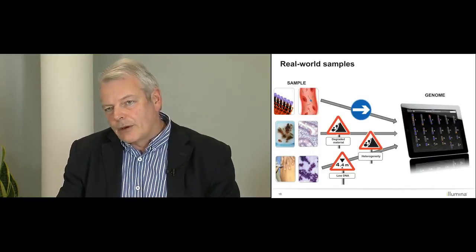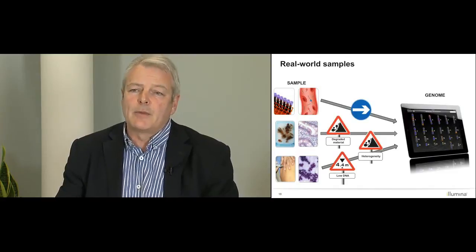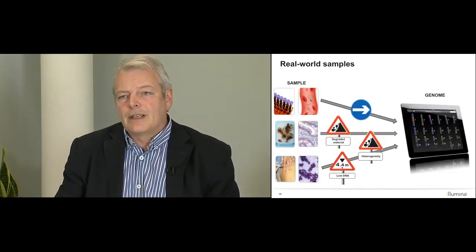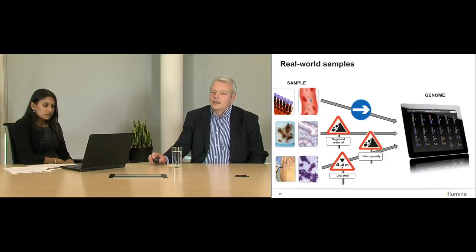The other, which I won't show any more on, of course, is biopsies, which are very important as a currency for collecting samples from individuals. And these, of course, only provide very small amounts of DNA. So it's very important that we continue to learn how to work with smaller and smaller amounts of material, while still getting that all-important, highly representative genome sequence data.